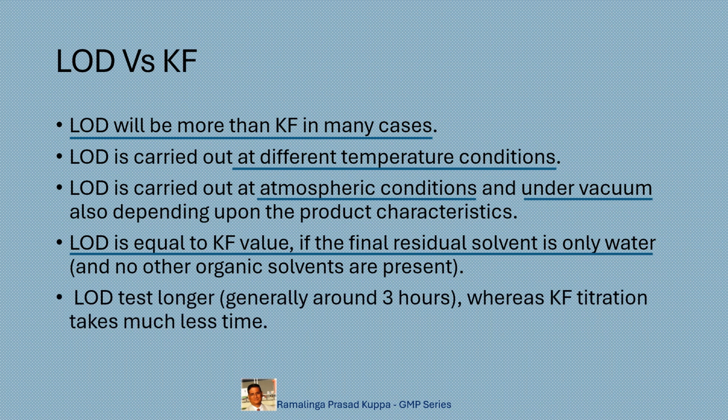The LOD test takes longer, generally around 3 hours, whereas Karl Fischer titration takes much less time. LOD is a slow process and takes longer test time, whereas KF can be done in much less time. But of course, KF can estimate only water content.